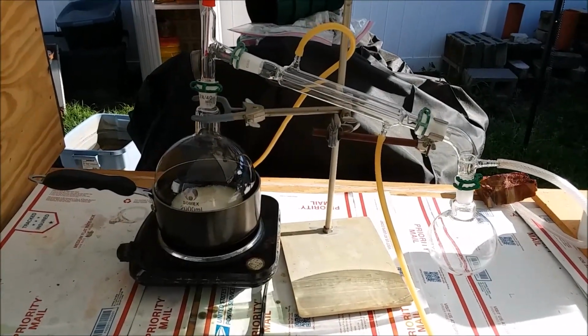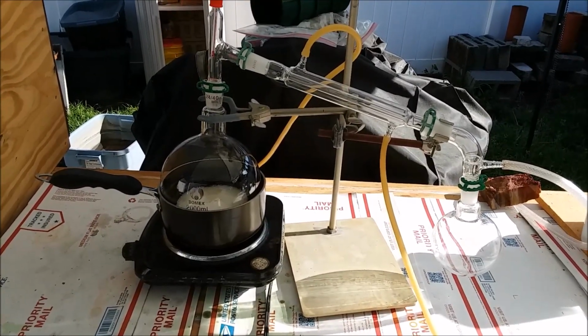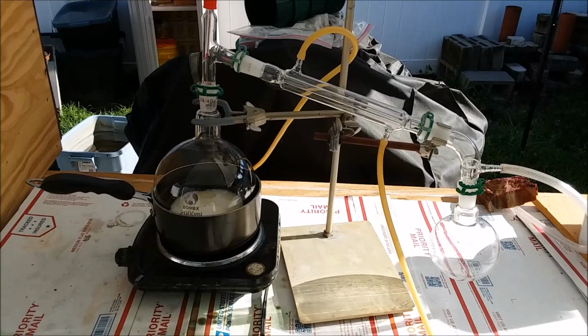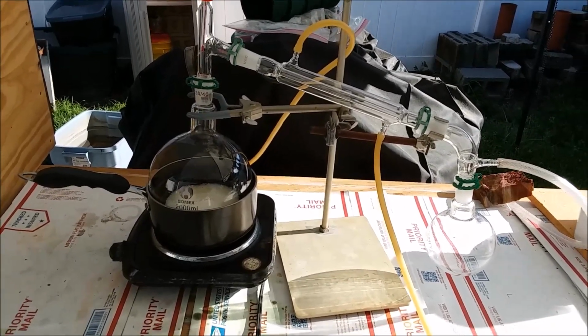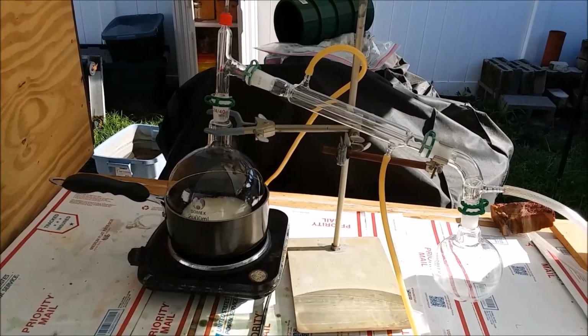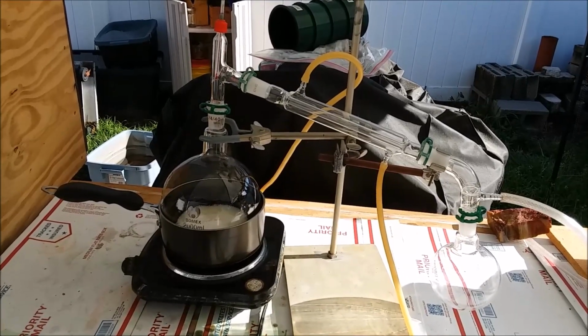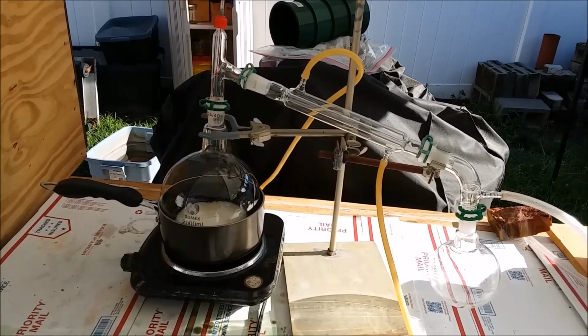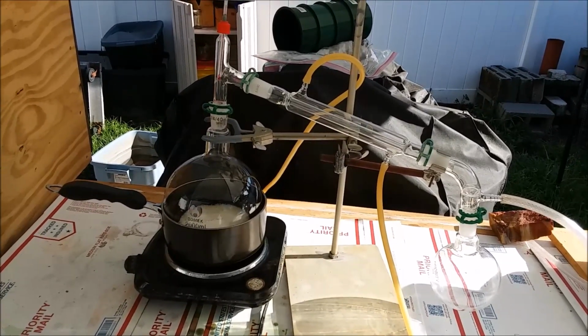So I'm making nitric acid again today for use in my gold refining hobby, but I'm doing it a little different today. I got the idea after the last run, if I bought another boiling flask and had a second one, I could swap out the boiling flasks and produce twice as much acid with only about the same amount of cleanup at the end of the run.